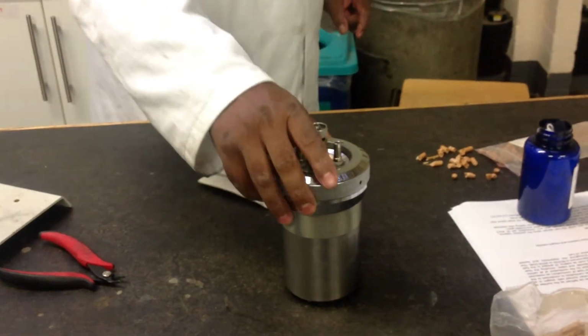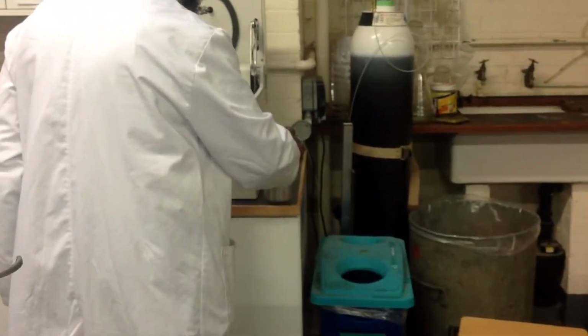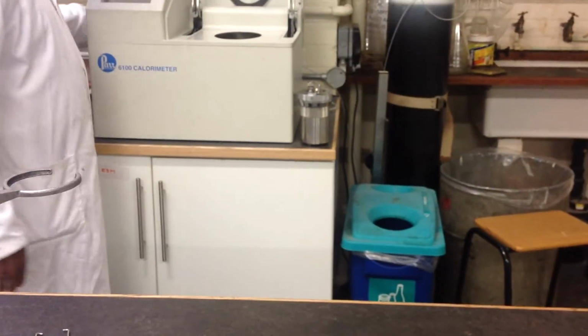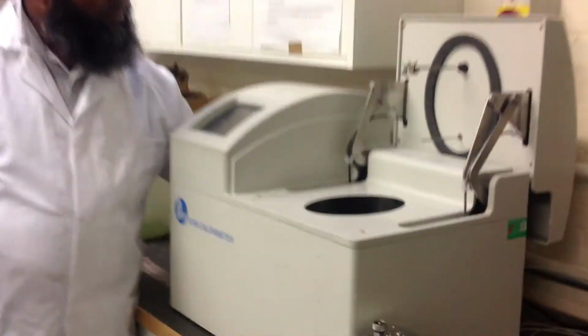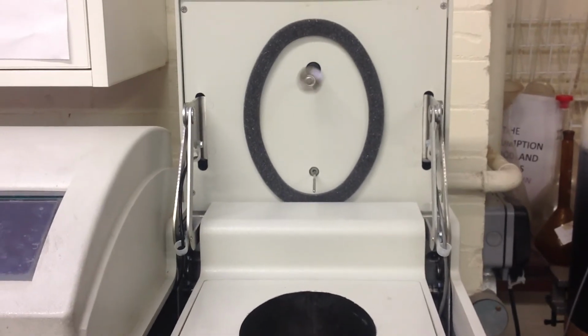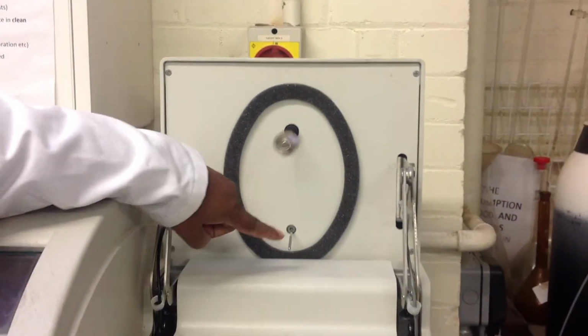Okay, and then we'll take this vessel next to the machine now. Let's switch on the machine. So you can see the machine now. This is a stirrer, and this is the thermocouple.